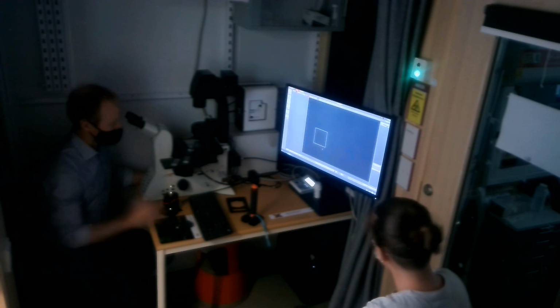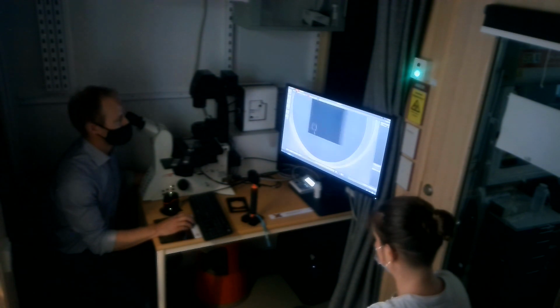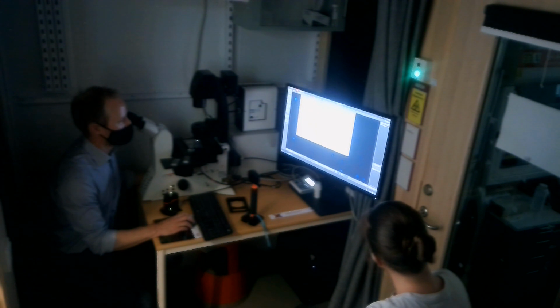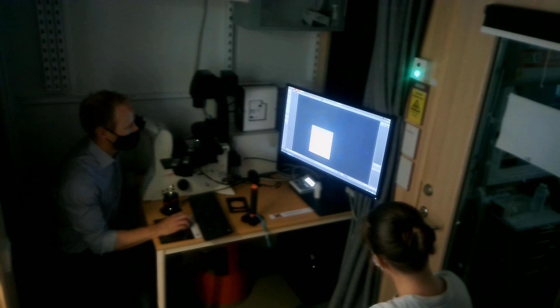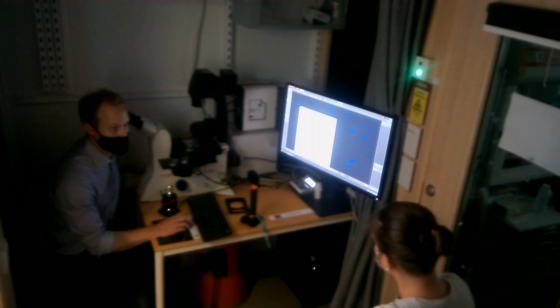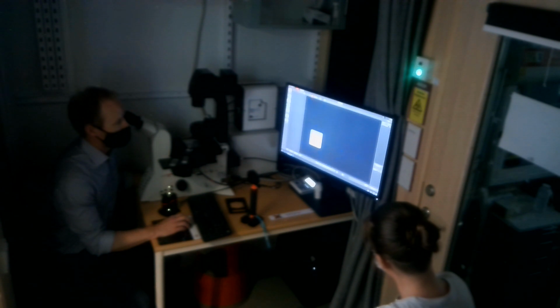Got it. So, let's see if I can see these ones at all. I'm guessing no, but I will have a quick look. Yeah, nice. Here with Brightfield we can see them quite nicely also. And with the Brightfield we can also see all the ones that don't have anything in. So I don't know if Brightfield is something that you typically use, but you could easily do both Brightfield and the fluorescence. You would get a quite nice overlay there.